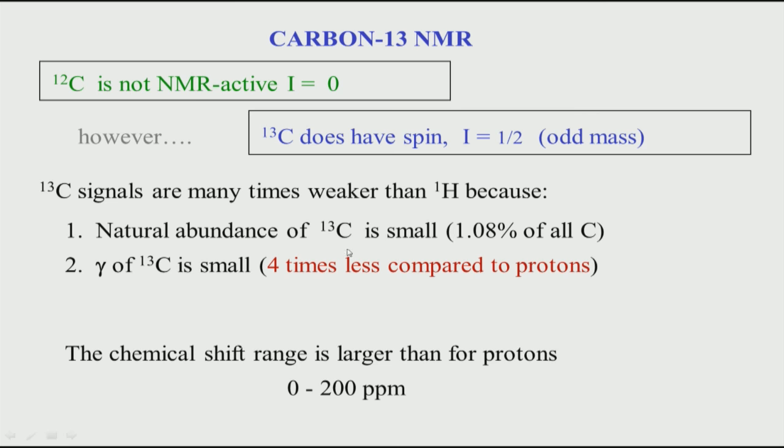So if you combine these two factors, you can see there is already a factor of 400, 4 coming from here, and 100 meaning only 1 out of 100 is carbon 13. So it is not 100% carbon 13, only 1%. Compared to proton, which is nearly 100% 1H, it is therefore 400 times less.